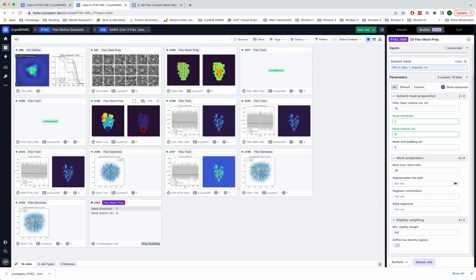And it is able to model correlations or similar motions of different regions, even if they belong to different submeshes. It still has the full freedom and flexibility to do all of that. We're just, by creating this mesh topology, also giving it additional flexibility in moving adjacent regions in different directions, for example.